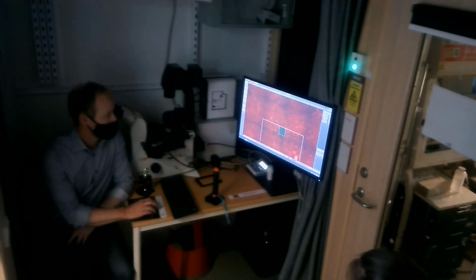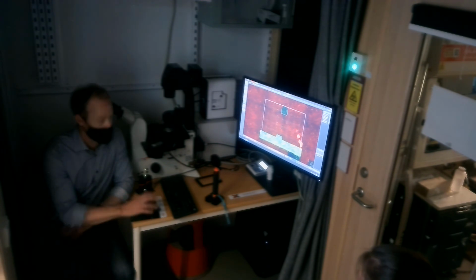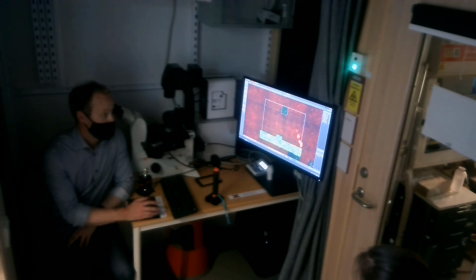But in this case, since we are locked to always doing the autofocus while running an experiment on the first channel, then with the sensitive sample, I would probably go in and do it by hand with an autofocus map, where I can really go down and save my sample and just find it. If you have a sample where you also know what your bright field looks like.